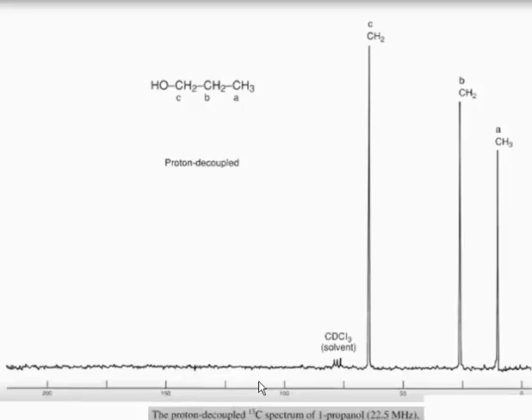Here we show a C13 NMR spectrum for 1-propanol. In this spectrum we have carried out H1 decoupling, so all the splitting effects of the hydrogens directly bonded to carbons are completely removed. Well, there are 3 carbons in the molecule, therefore we would expect to see 3 signals. Each carbon is different from the others. Each carbon is a set of one non-equivalent carbon, if you will. And so because there are 3 different carbons, we see 3 different signals, and here they are, 1, 2, 3.